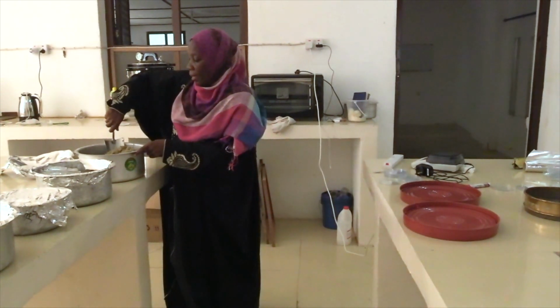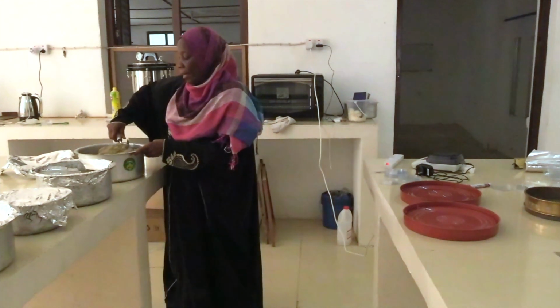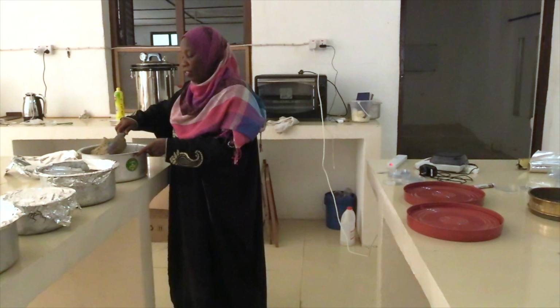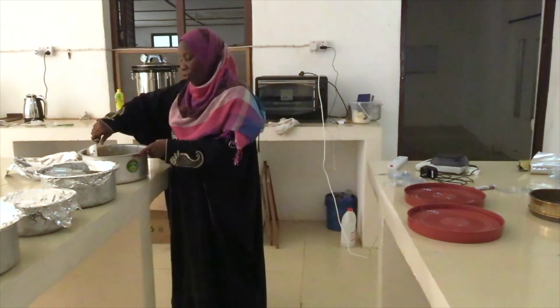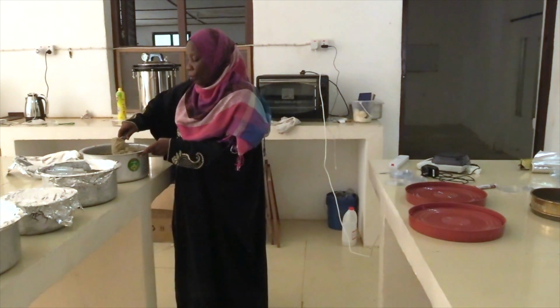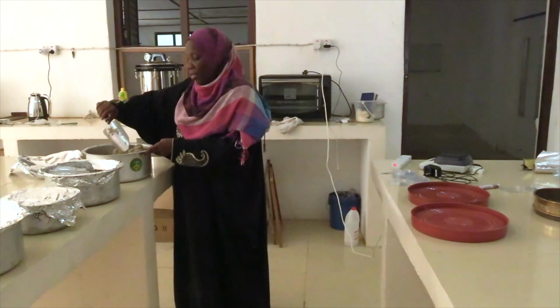Because if you take only the upper layer, maybe all the water has come to the bottom of the sample. So first of all, we will homogenize the replicate, all of this.